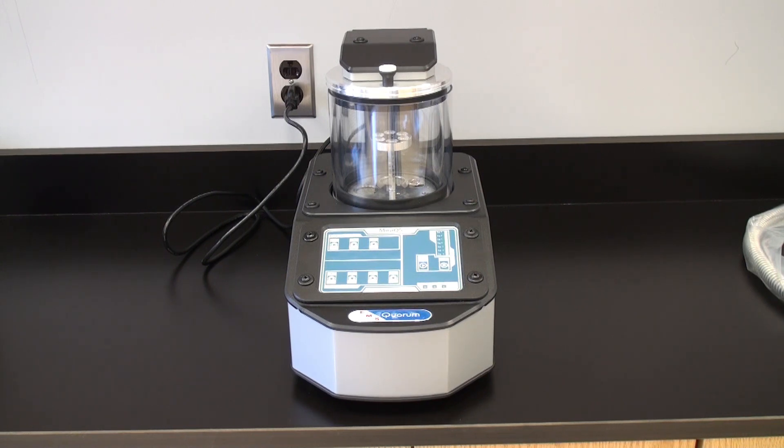I am the applications and service manager here at EMS Electron Microscopy Sciences. Today I'd like to introduce you to a new coating tool introduced to our line, and that is the MiniQS, which is an entry-level sputter coater designed to cater to laboratories with tabletop SEMs who don't need sophisticated coating capabilities or even regular tungsten filament electron source SEMs.